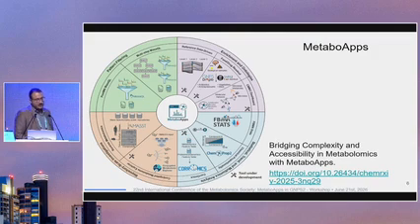The third section is basically the statistical trend and multi-omics analysis. And for that, we have the FBmn-stats that I chose to discuss a little bit more today, because it gives an overview of many basic statistical tools that most of us use for metabolomics data. And then we have also the ChemProp2, where you can work on the proportionality between your fragments, and it can give you some new insights on that information. And also we have the Coromics, where you can do correlation between multi-omics data.